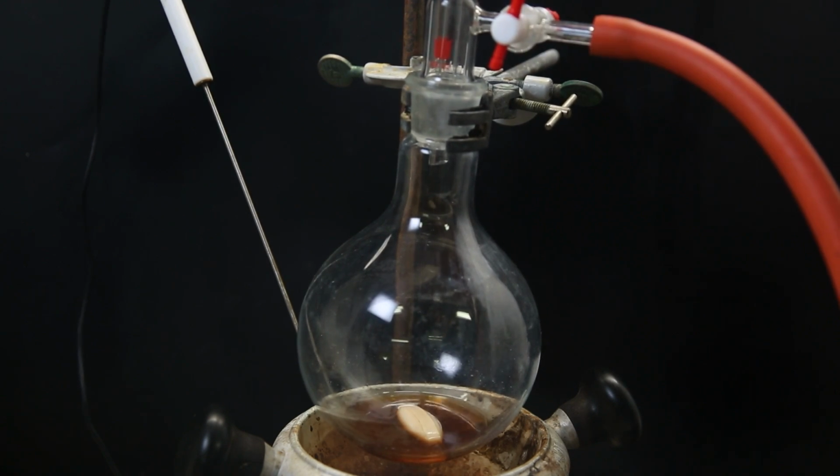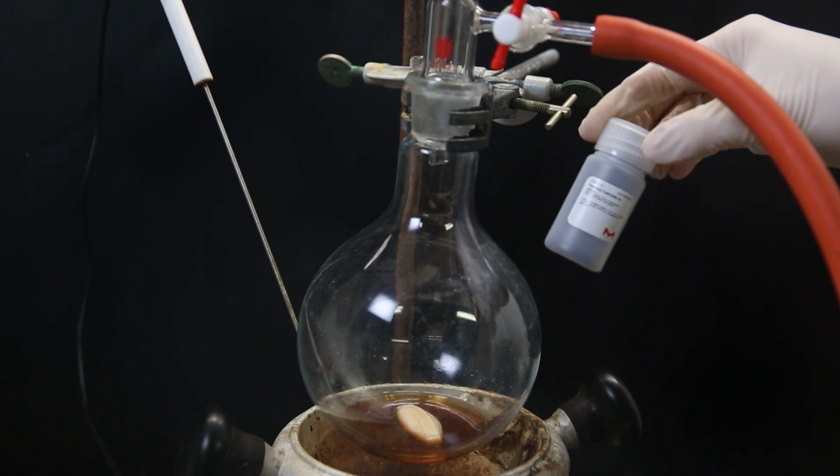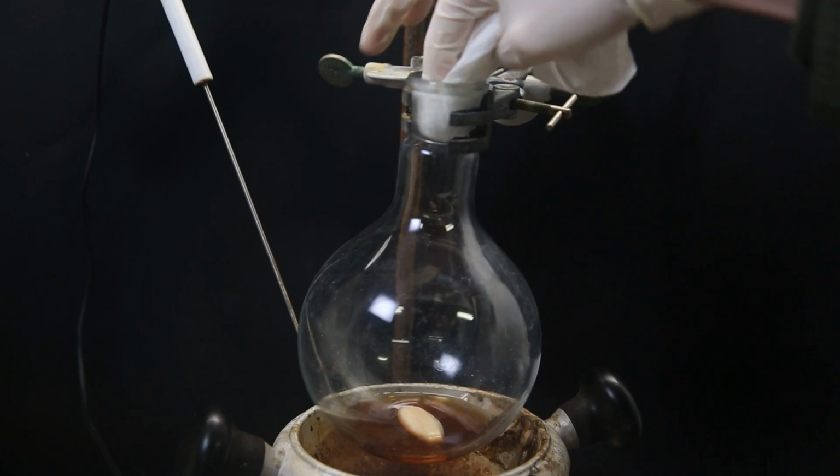I then open the way to a balloon filled with CO2, which rushes into the flask. Since CO2 is basically unreactive in this case, it will prevent the catalyst from potentially igniting the solvent when it is added. I repeat this process 3 times and then remove the adapter.